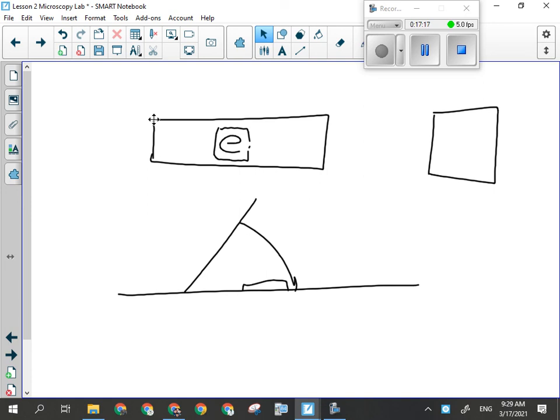You're going to be using those pictures for your lab diagrams. We're in the digital age. You don't have to do these by hand like I did. Pre-digital cameras, we actually had to draw by hand, and I suck at drawing really bad. So my lab diagrams are very bad. You guys get to do lab diagrams with actual pictures, so it's much better. So you'll take that picture and then you'll use it to make your lab diagram, which I'm going to show you how to do in a little bit.